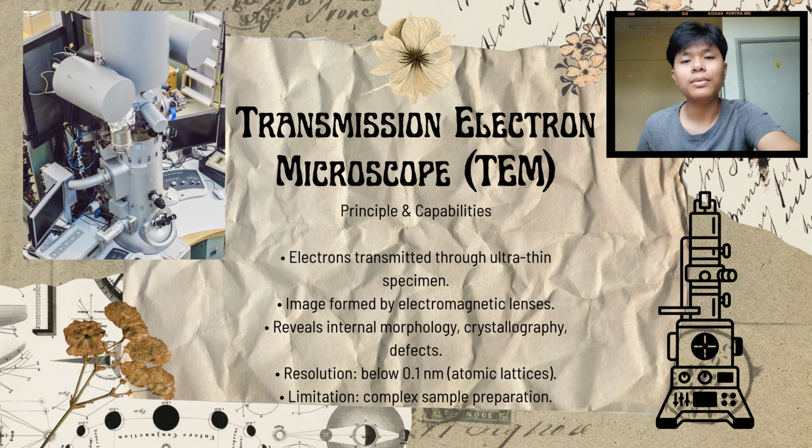Okay everyone, now I'm going to present to you the types of electron microscope. The first one is the transmission electron microscope, TEM. The principle of this microscope is that electrons are transmitted through an ultra-thin specimen on the stage and the image is formed by electromagnetic lenses.